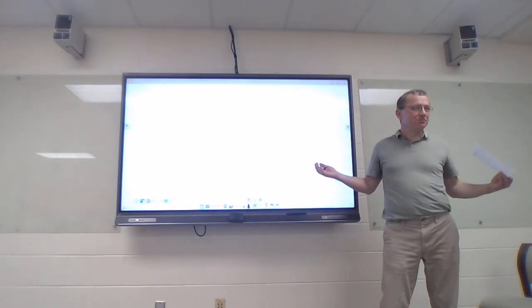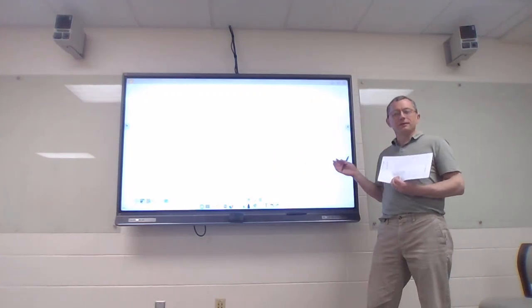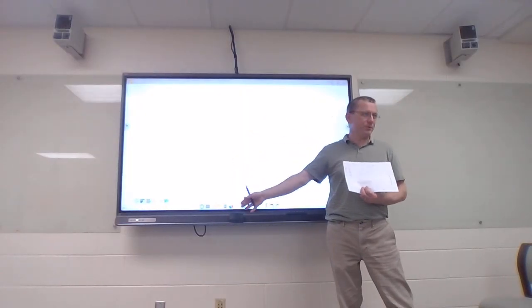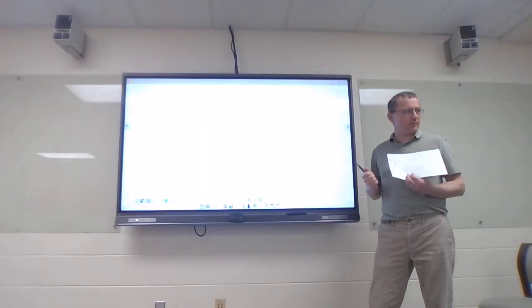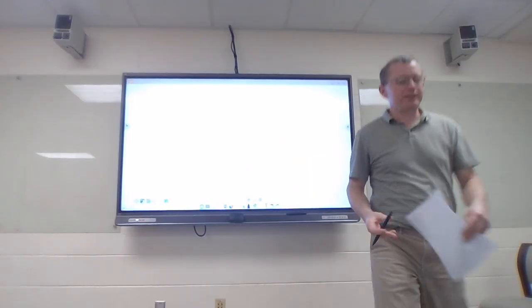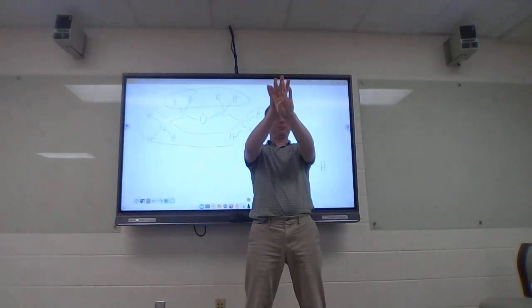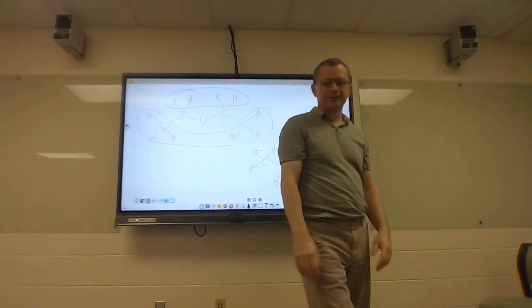The bonds are weaker. The oxygen-hydrogen bond is much weaker than a carbon-hydrogen bond. We can break a carbon-oxygen, we can break an oxygen-hydrogen bond far more likely than a carbon-hydrogen bond. So because of the weakness of that, it's kind of hard to capture. And so you get a much weaker splitting due to that one, but it's different than those 3. So what you're really seeing are 4 peaks split into a doublet by that other hydrogen, and they just kind of shift slightly over, so they're kind of right on top of each other, and they look like that, unfortunately.